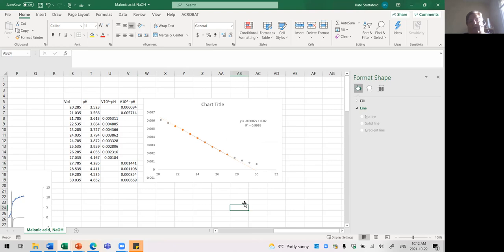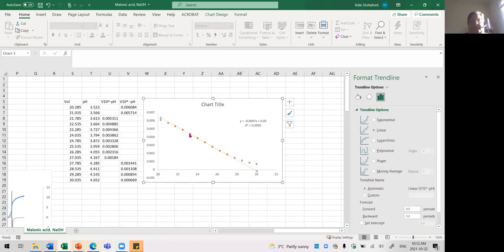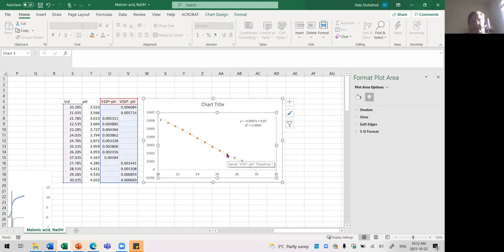So now this Gran plot, we suggested going back 10 to 20% of the volume. So that would be back up to about 6 milliliters. We're going to 8, which is a little bit more, but I still think that's fairly reasonable. Oh, the other thing that I should point out is because this plot is including all of these blank spots, the line is actually extended beyond the data. Okay. So if I look at, it's not going to let me click on an orange point.